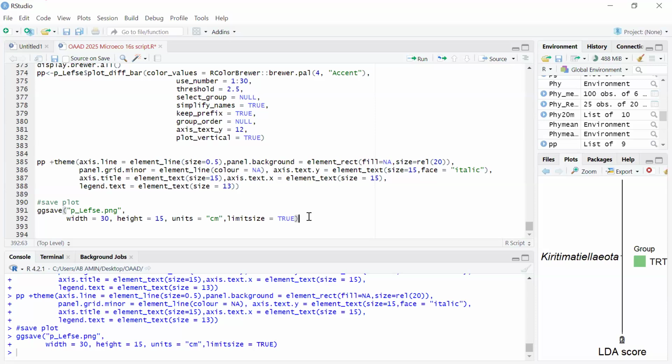In that case, you need to do further analysis, just like my colleagues mentioned. You can send those samples for sequencing. Based on the sequences, we can blast them in NCBI or any database to know the specific differences in terms of their protein structure. Then based on that, you could do further analysis and release it as a new bacteria. That could be useful to your study or to the objective for which you conducted the study.